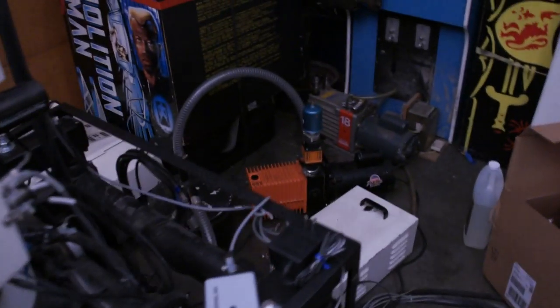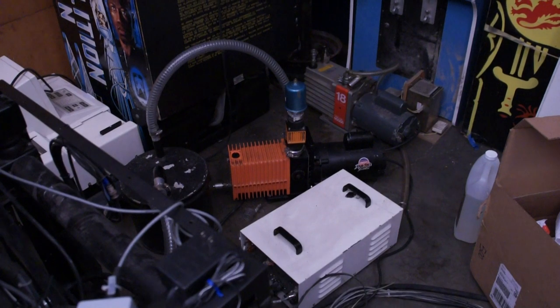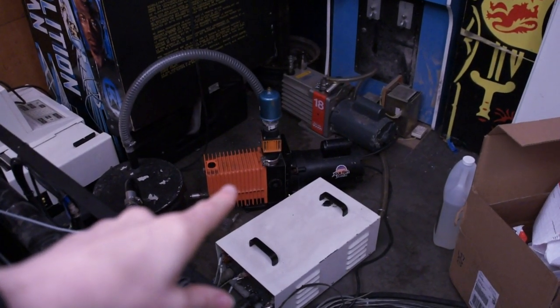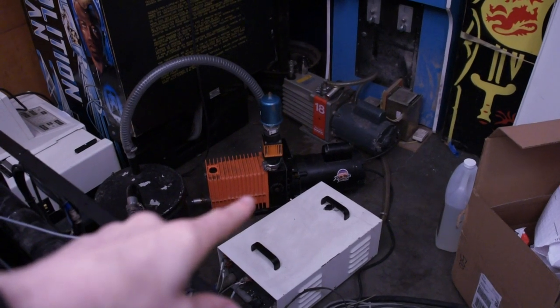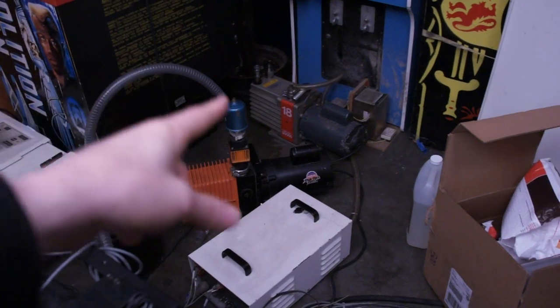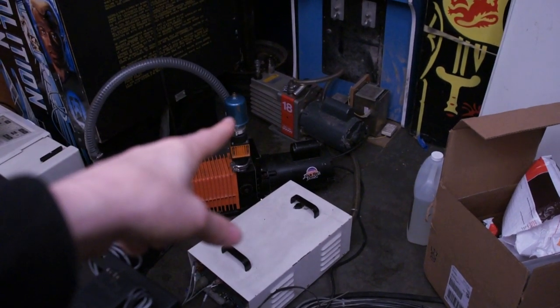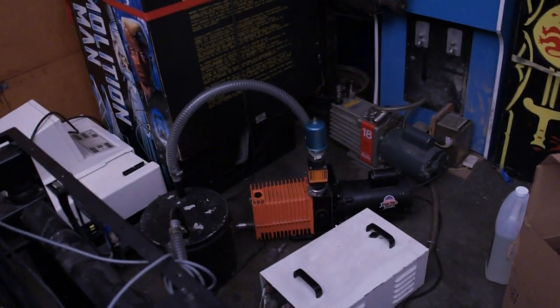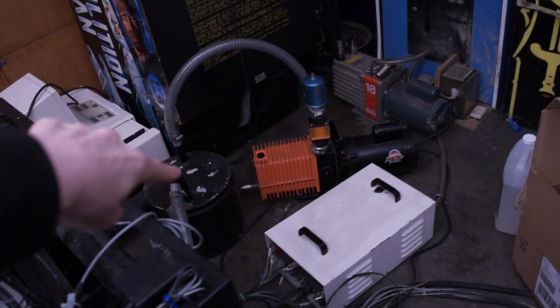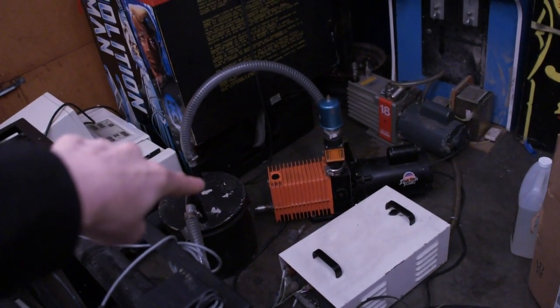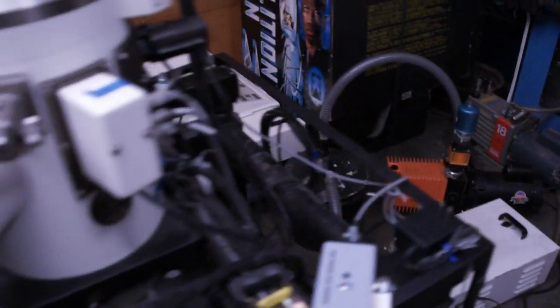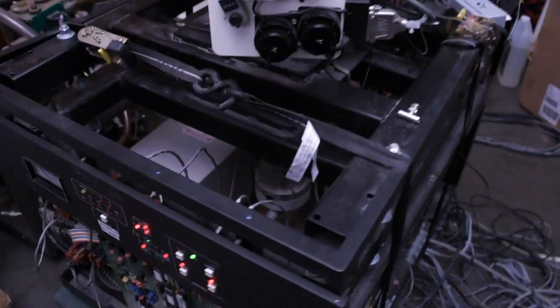So the vacuum system for this has to be under a very high vacuum. It starts off with a mechanical roughing pump. This is an oil-based vane-style pump. It has rotary vanes that are dragging air through this pipe and then venting it through that little blue mist filter there sticking up. This pipe here runs into a big can full of cement, and that's just to keep the vibrations in the motor from making it all the way to the microscope itself.